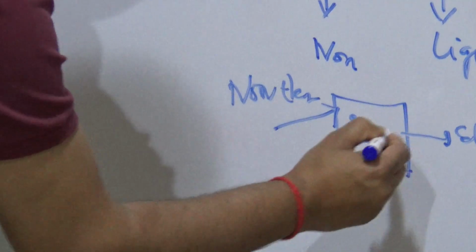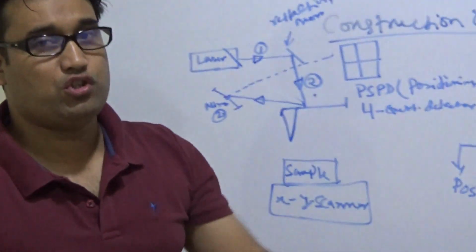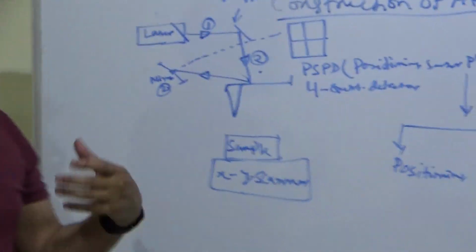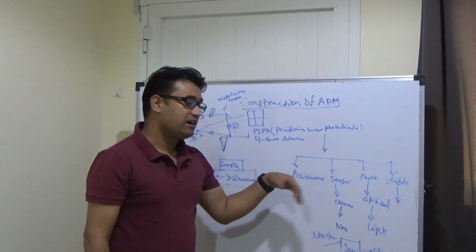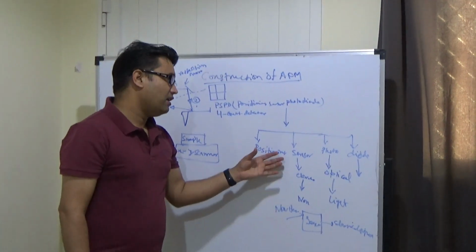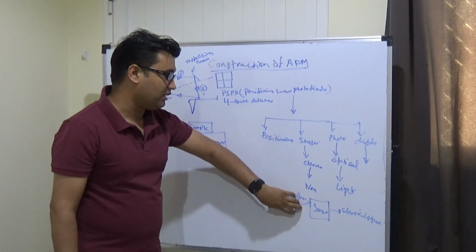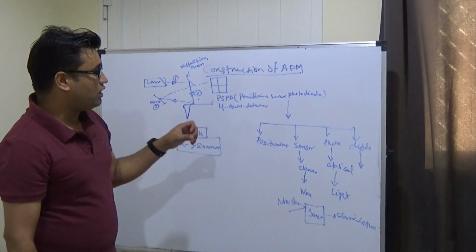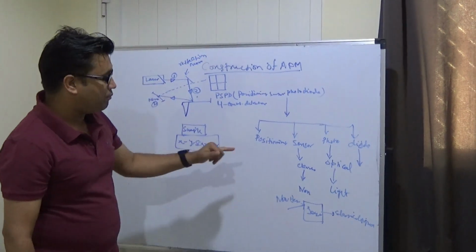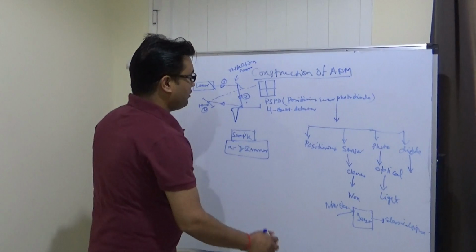And another thing you miss is what is the difference between sensor and transducer. I will make another video and then talk about what the sensor is in good detail. What is the relationship between the two? What are the basic differences? Sensor means that when we get the output in the electrical signal, the non-electrical signal still exists. And so, in the non-electrical signal, you become an optical signal.